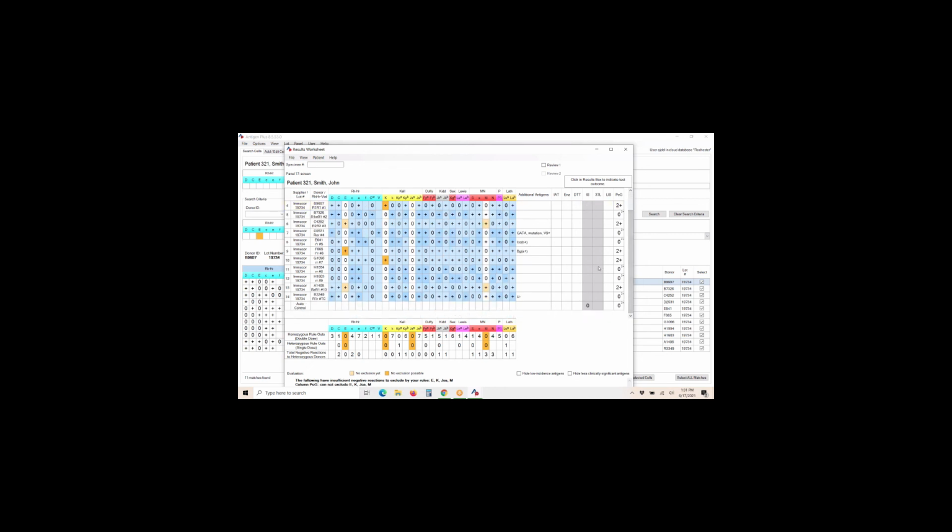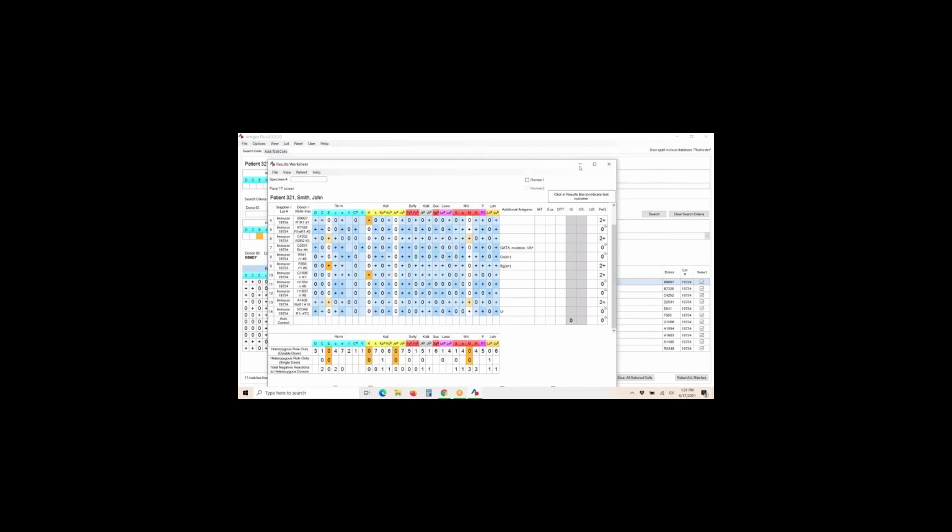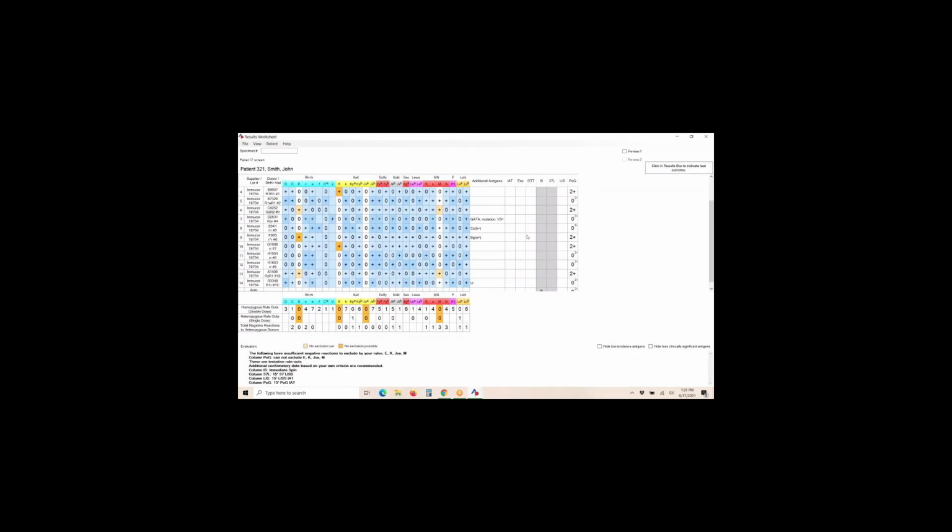Okay. Alex, why don't you expand that screen, make it bigger? Yeah, thank you. Okay, so you have to scroll. Here's your screen, and you can scroll down and see the rest of the panel.